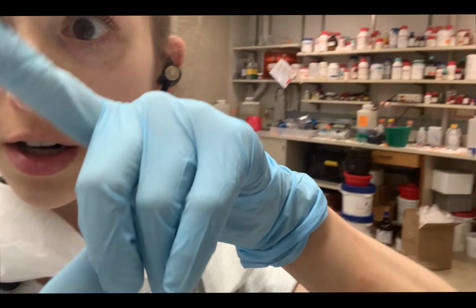And then you have that ATP only sample. Remember, you didn't wash that. You don't want to wash that, but you want to wash all the others.